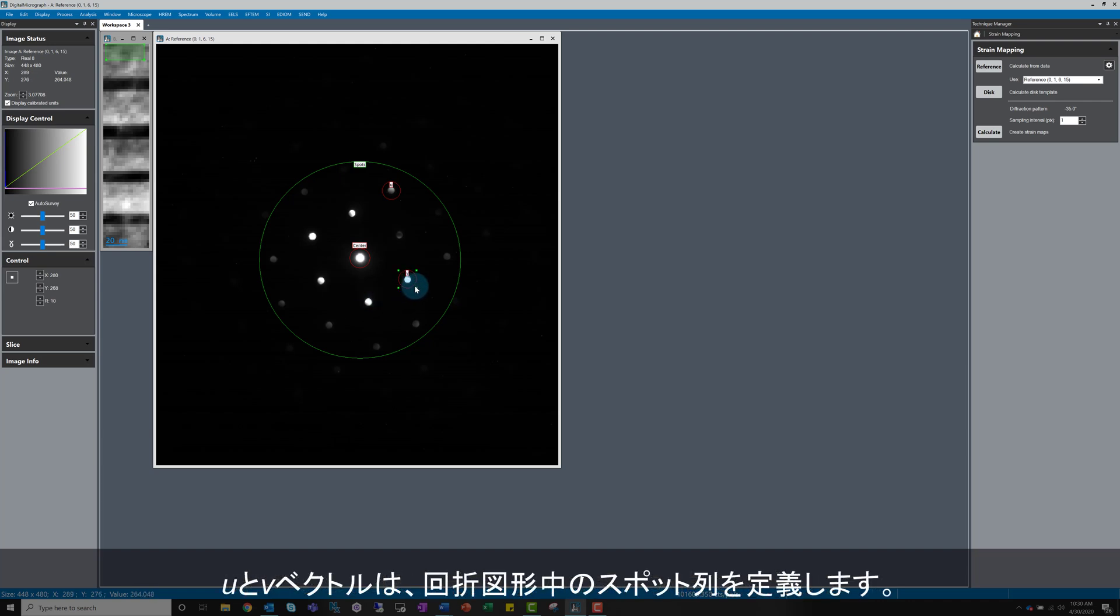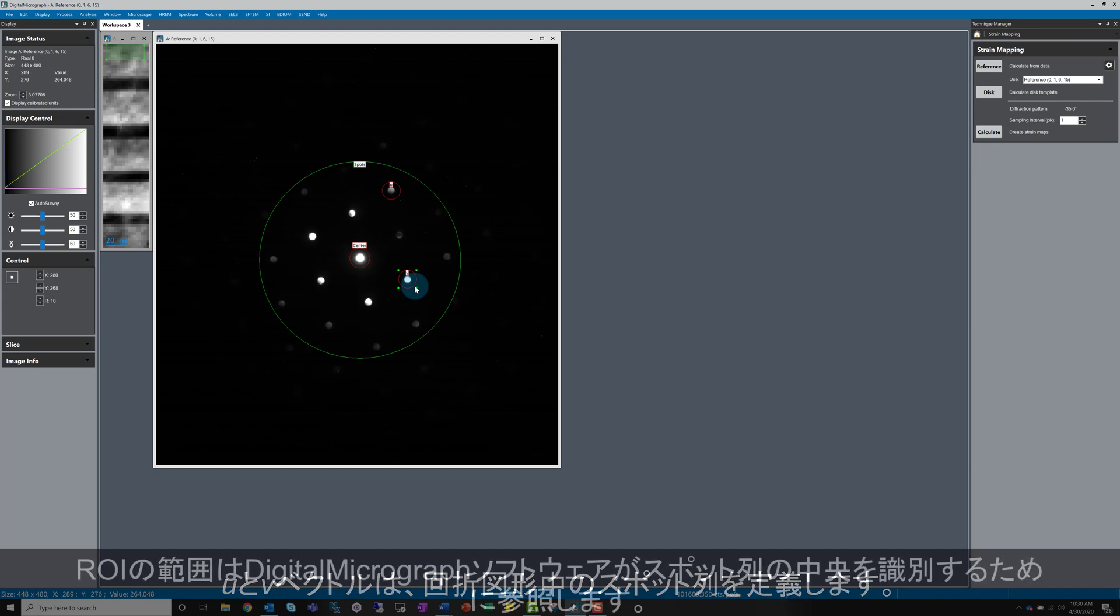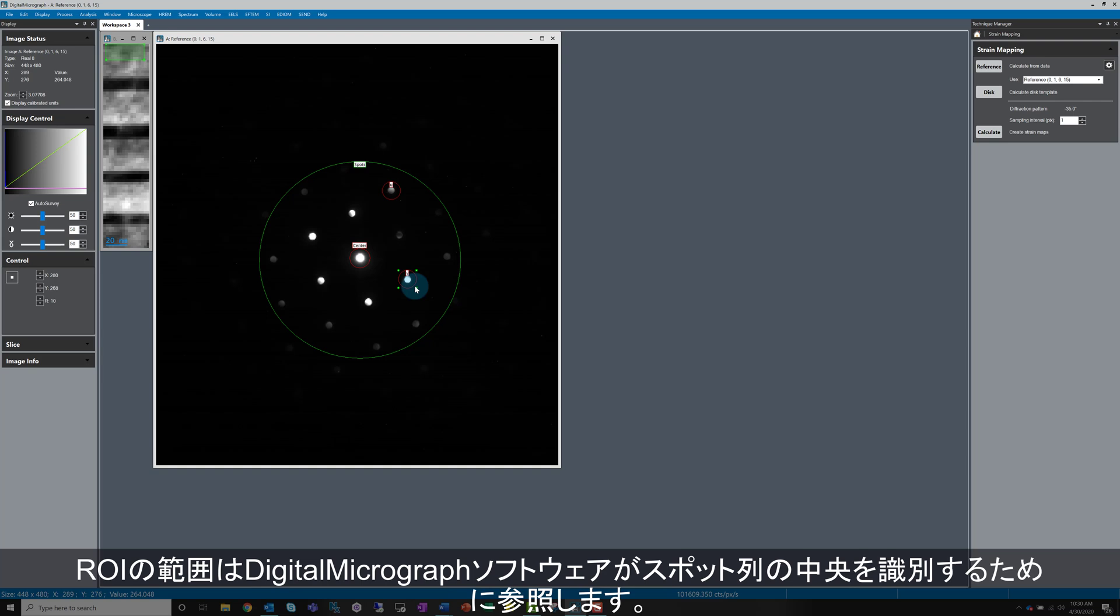The U and V vectors will be used as the unit vectors that define the position of the spot array in the diffraction patterns. The circle size will be used as the search radius when Digital Micrograph is looking for the spot centers in this array.